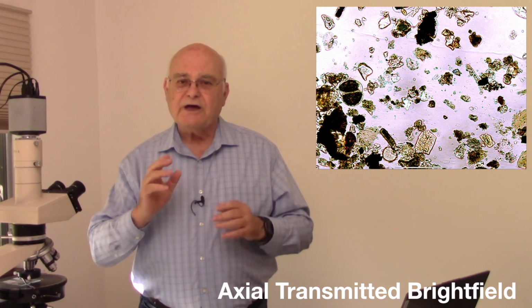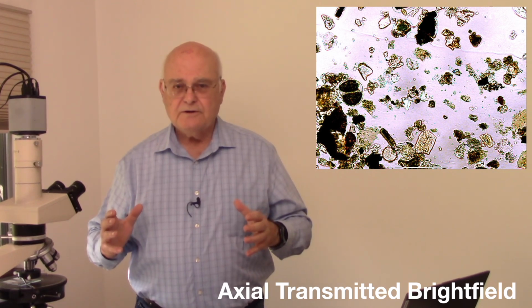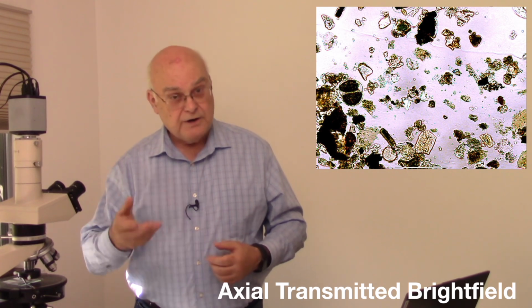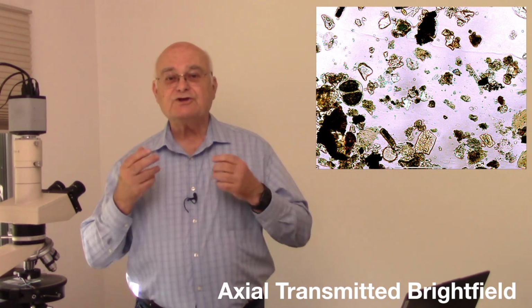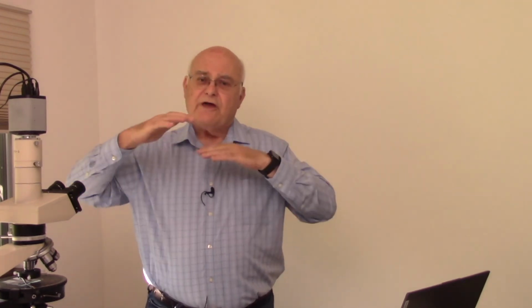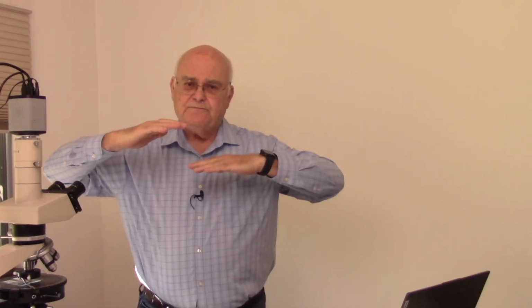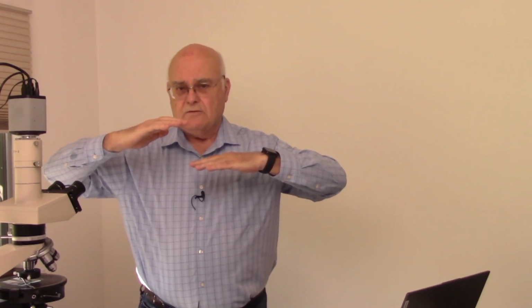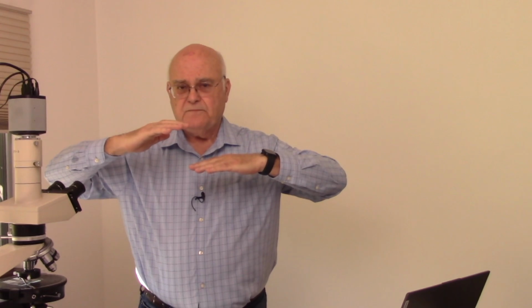When that single beam is coming through, we optimize contrast, but we lose resolution. But another advantage is that we have greater depth of field.